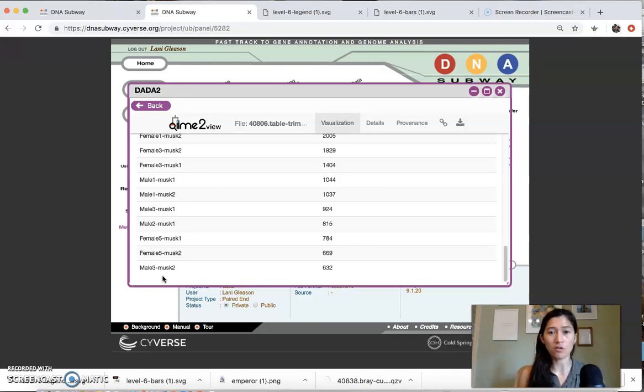As long as you're not throwing away half of your data set, in general, it's better to maybe throw away 1 or 2 samples to make sure the rest of the data that you are looking at is really good quality and you're confident in it. So from this table here, the main thing we're identifying is this number here that's the lowest above 800, which is that cutoff we determined previously. So make a note of this number 815.